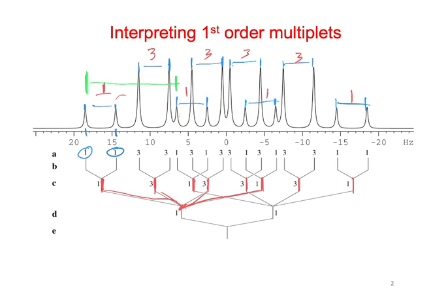So we have this doublet here. That would be similar to this one. So this, and then doublet, doublet, doublet. So here's a doublet. This is a quartet, 1 to 3 to 3 to 1. And then from 1 to 3 to 3 to 1. So there's two big quartets.